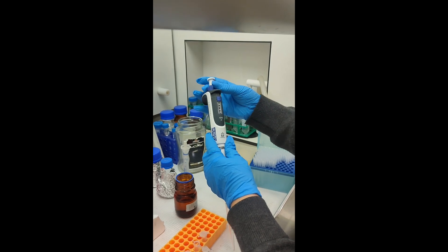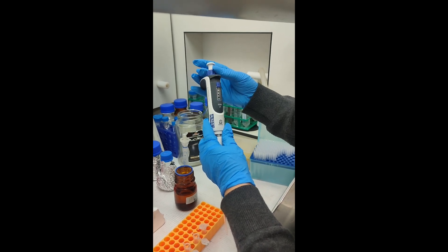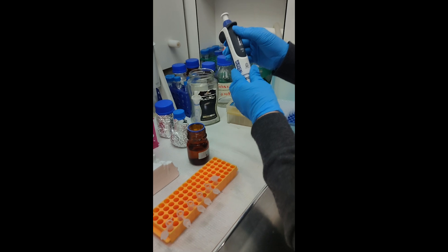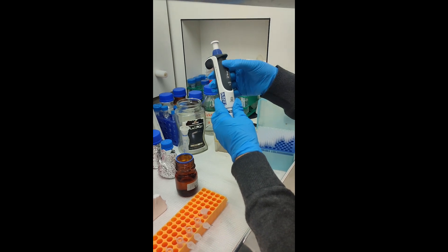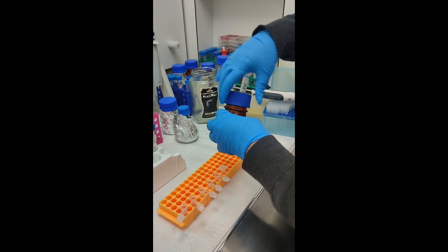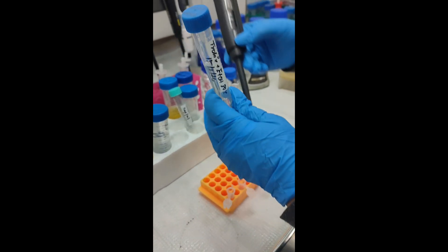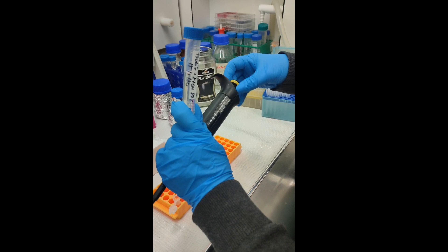We need to put 1,350 microliters. Isabella is putting 6 on the rail to the first one, and another 750 microliters. This is Trolox, 1 milligram per milliliter. And 150 microliters.